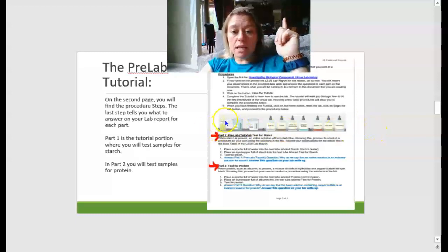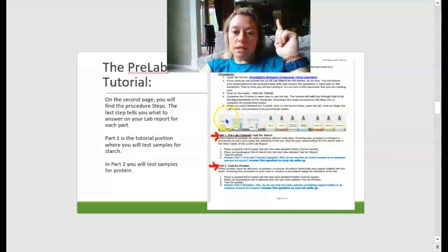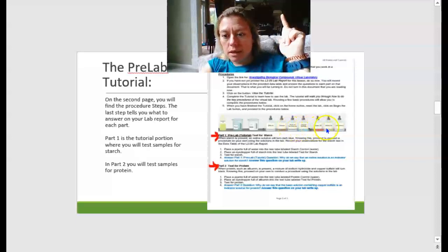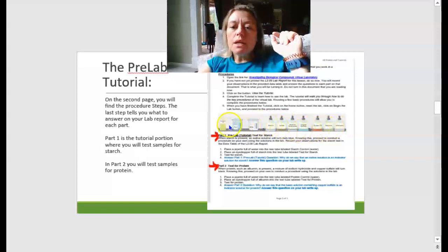I've put this graphic here just so that when we talk about this in the pre-lab, which I think I did on Friday for you guys, I've described everything here. Here is the vegetable oil, here's the water, here's the milk. And then you're going to see a starch solution, which just means sugar water, and iodine. Those are the 2 indicators. That's Sudan 3. My eyes are too old to see that tiny stuff, but you can read it. These are on the top shelf above where you're going to be working in the lab.